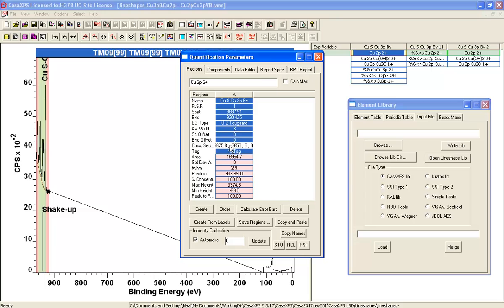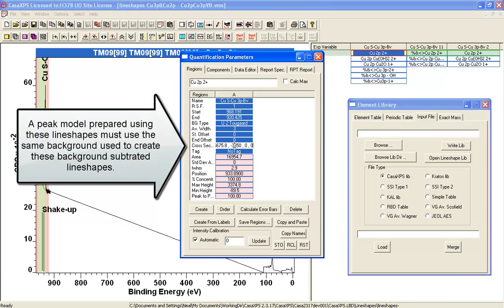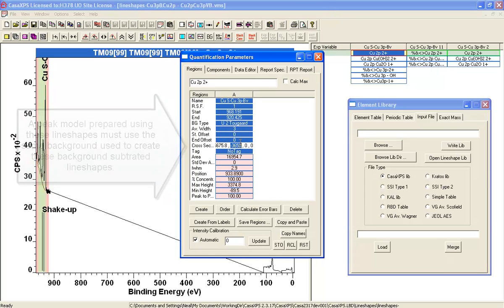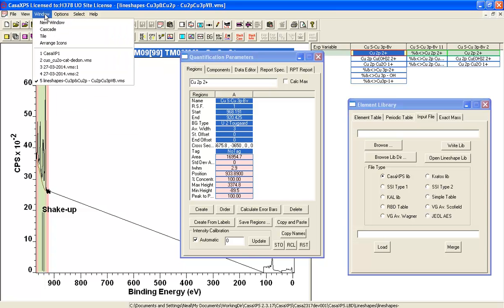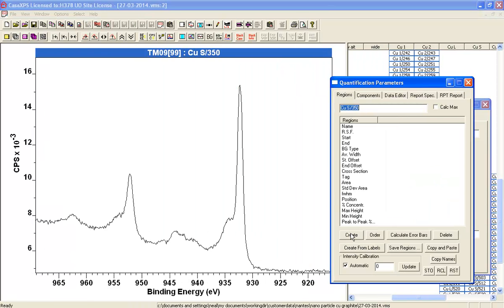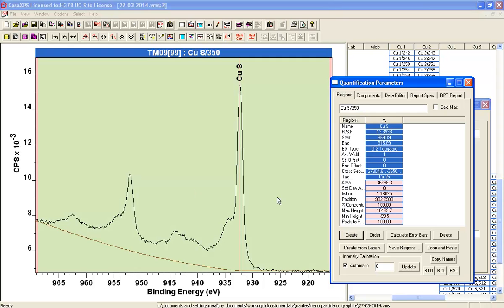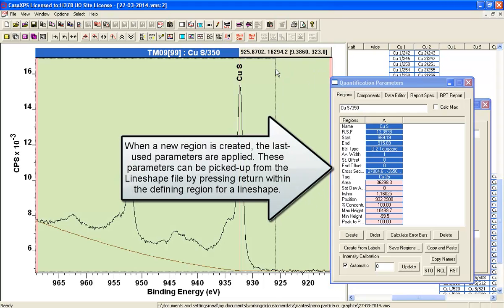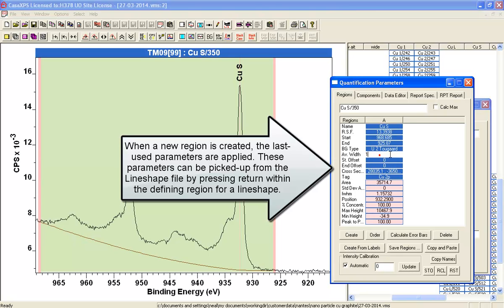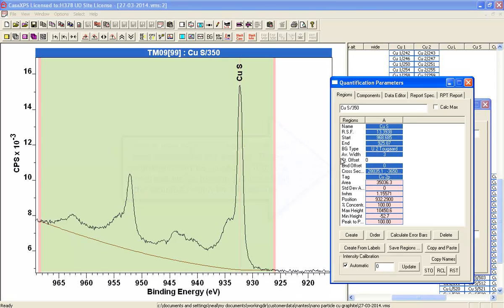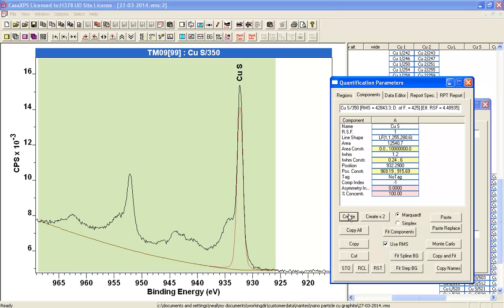So the first thing we need to do is understand what background was used for these data. And the background is a U2 Tougaard background, and the parameter that is important to a U2 Tougaard background is this one here. So I need to make sure I'm using the same when I create a peak model for the data that I want to analyze. So I create a background. Let's give it a little bit more stability. And what we can do is create a peak model based on these line shapes.